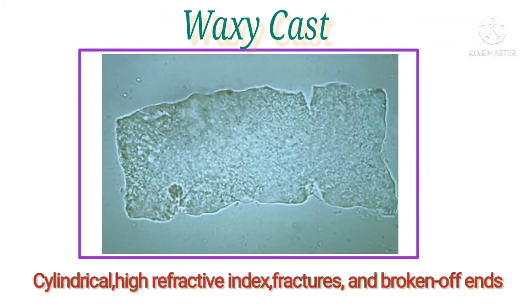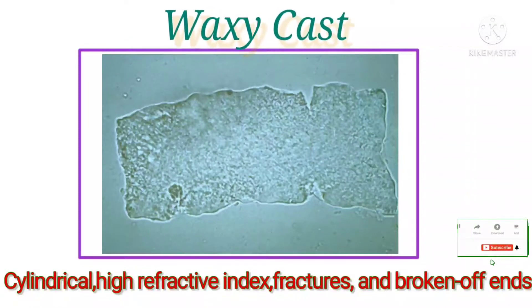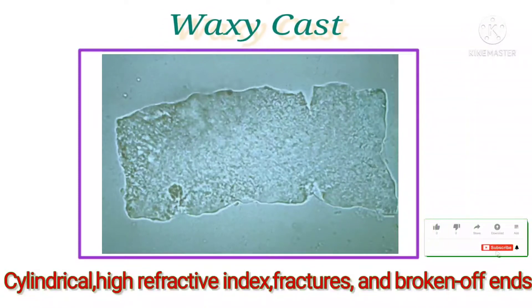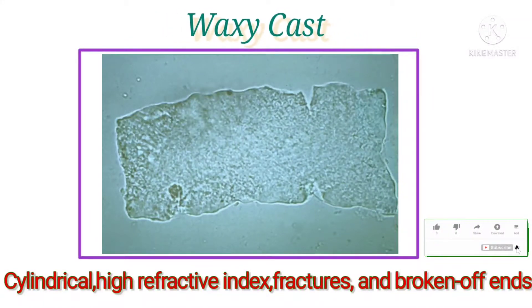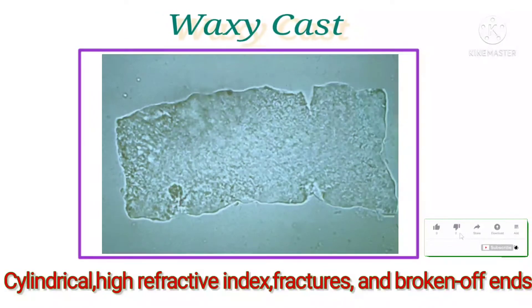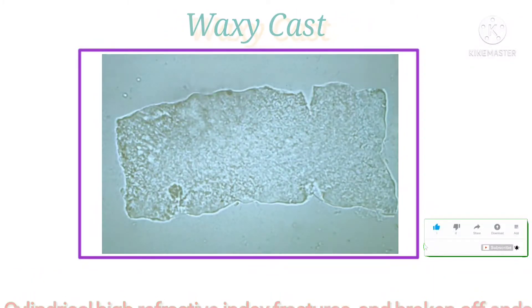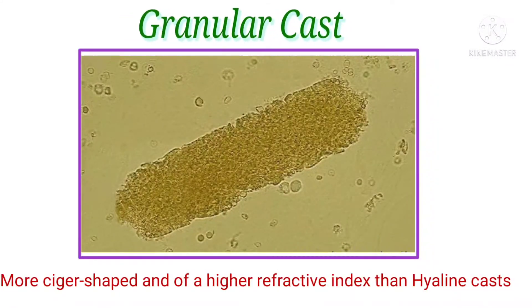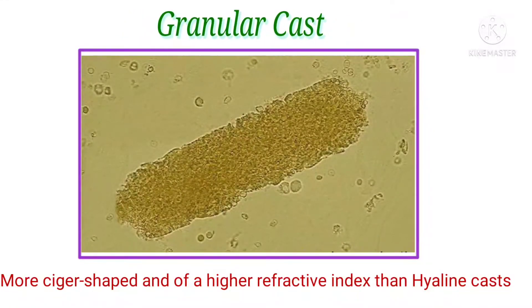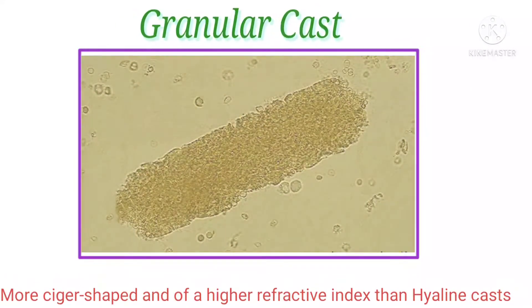Waxy casts are cylindrical and possess a higher refractive index. They are more rigid, demonstrating sharp edges, fractures, and broken-off ends. Their appearance is generally more cigar-shaped and of a higher refractive index than hyaline casts.